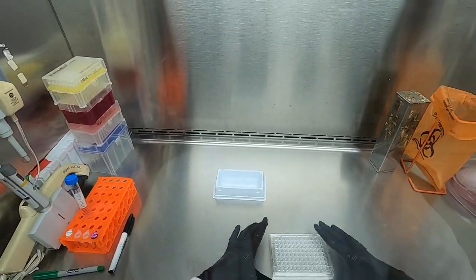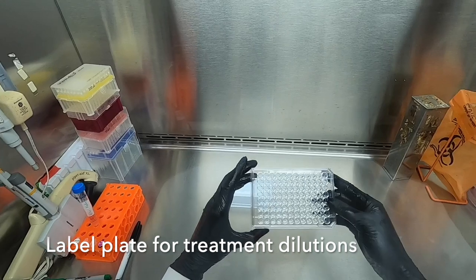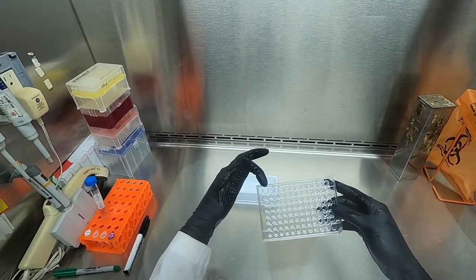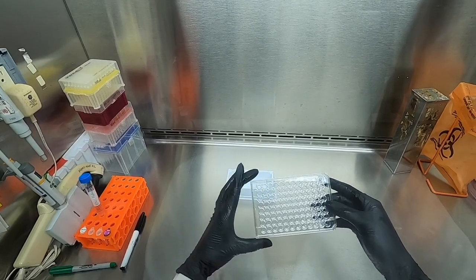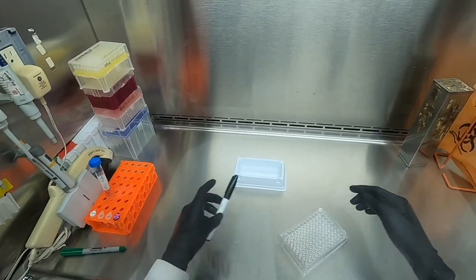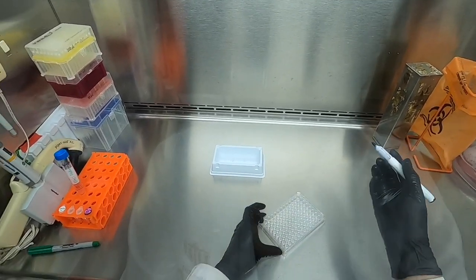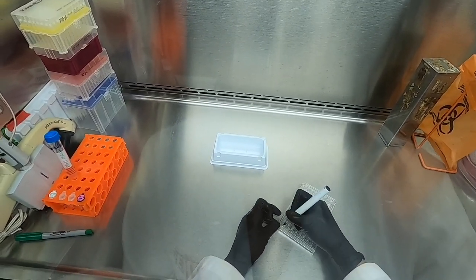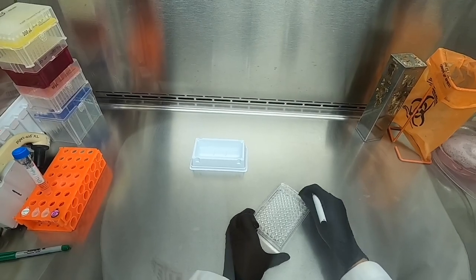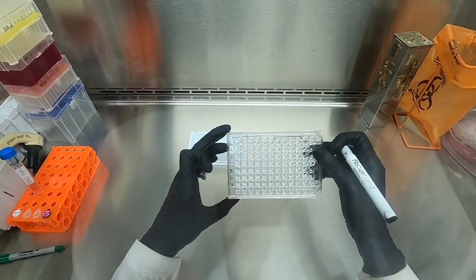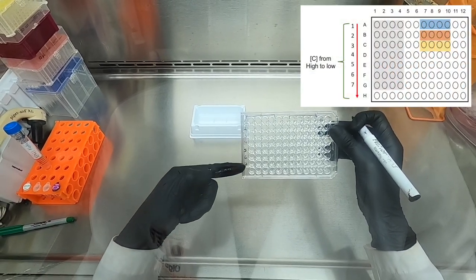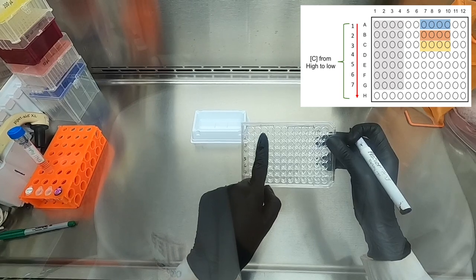Instead of using micro centrifuge tubes in order to make our serial dilutions, we will be using a 96-well plate in order to easily transfer the concentration gradients from one plate to another using our multi-channel pipetter. We have now labeled our plate with seven different concentrations and four different replicates.